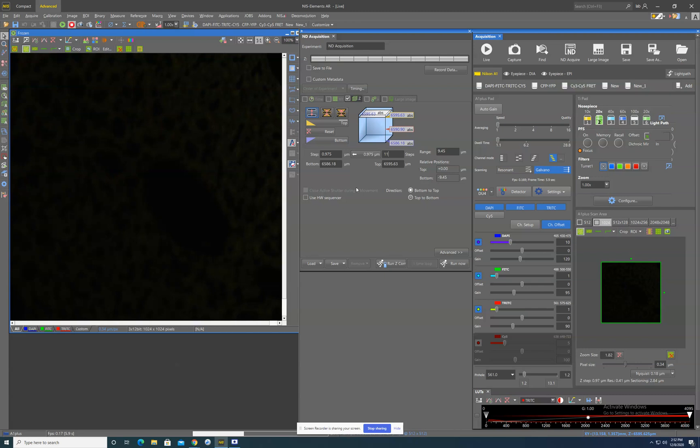If you're doing something like co-localization or 3D reconstruction or deconvolution, you always want to go with this recommendation. And you also probably are going to want to have a higher magnification. This is only on 20x. You often need to do these sorts of more complex 3D imaging at 40 or 60x. But if you're doing something at a lower mag and you don't really know how many pictures you would like to take, this is a great suggestion.